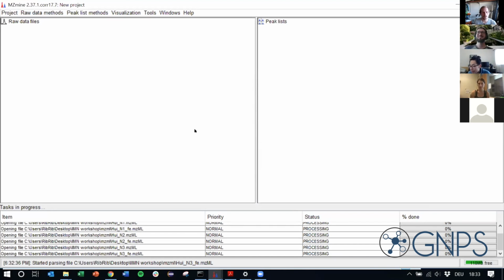So, yeah, there was one question why we did not do gap filling here in particular. Want to go into that now or later in the breakout room? We can do it later in the breakout room, but we also have some time here. First of all, we're not going to apply statistics and really need the values to be as correct as possible.